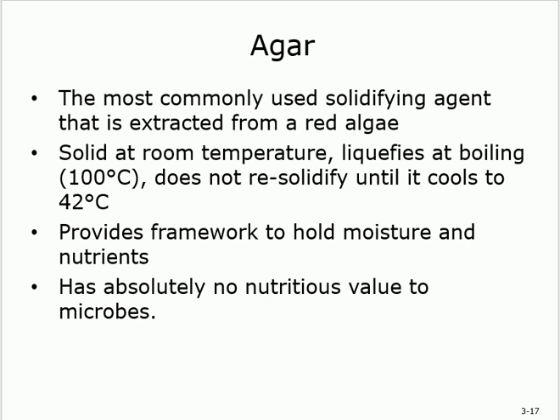It's basically the most important component in that agar or red algae is the polysaccharide. Okay? It contains polysaccharide. So what do you mean by solidifying agent? What exactly is it going to do? Why are you adding that to the medium? Agar is solid in room temperature, but you can liquefy and you can solidify. You can change. The numbers here are important to remember.